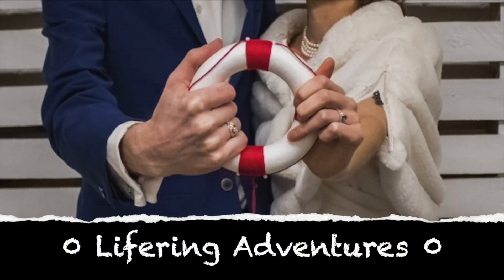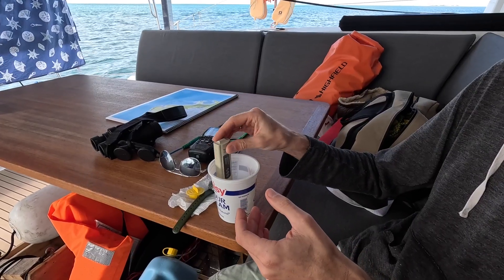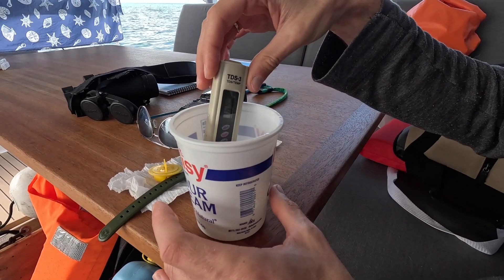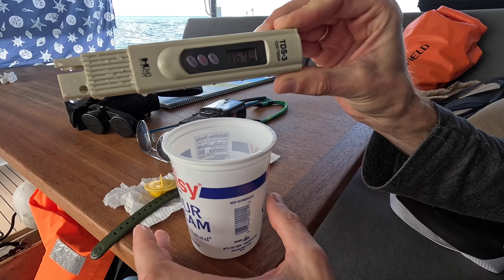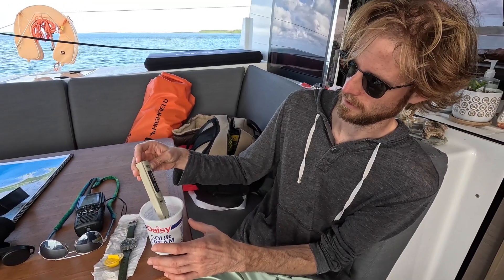We think it tastes saltier, so we want to see if it's actually salty or not. Here's our West Palm water — reading 165, 168. It's just measuring conductance as a proxy for dissolved salts. Settling at 167.